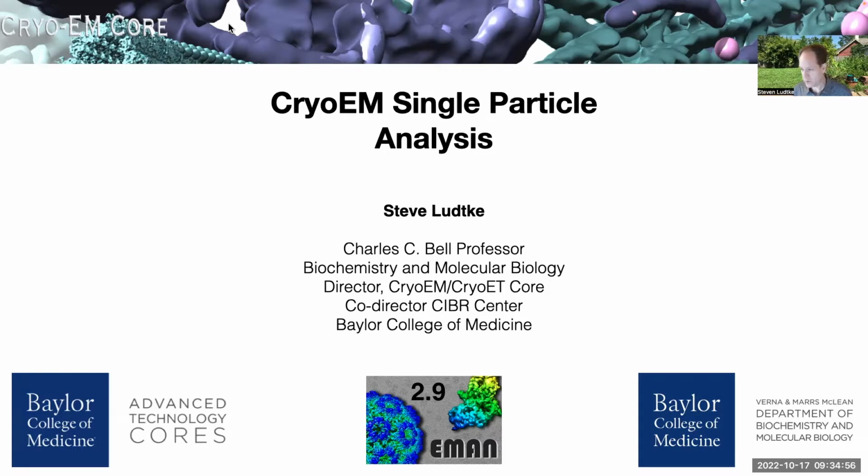So in the first week, we'll target the single particle analysis tutorial. In the second week, we'll target the subtomogram averaging tutorial. And then in the third week, we'll target the dynamics. If we wind up doing a lot more discussion and getting in depth, we may stretch that out for another week or two. Beyond that, we'll just have to see how things go. But today we'll just start out with this little lecture.